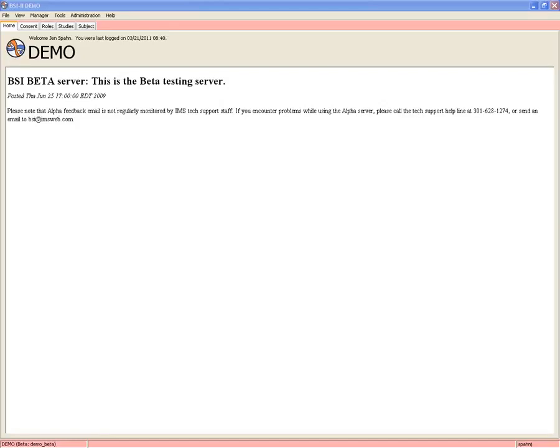There are some prerequisites to having the consent module. You currently need study level security. You have to have a study that requires authorization, so that you have to add study level permissions for the study to add consent for it. And in order to add patient consent, or what we call patient consent, you must have the subject ID in the system already, either on a specimen level, specimen sample level, or in the subject module.